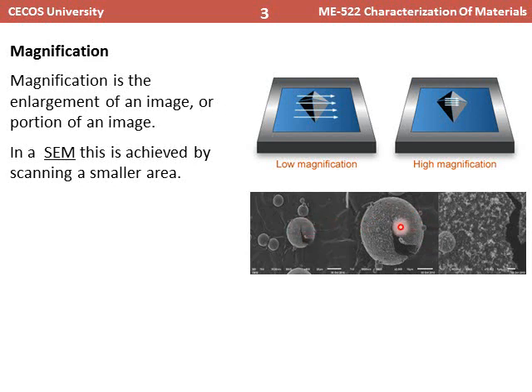Furthermore, if you want to clarify what's inside this artifact and what its surface looks like, because from left to right there is more clarification of the surface morphology, you pass the line scan more thoroughly on a very small area.